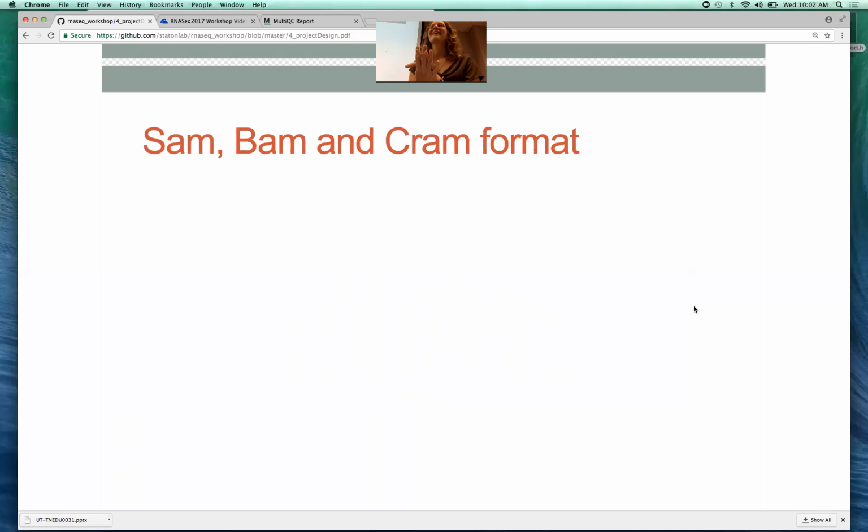So this may be too simple a question, but why so many reads for the same sample? I view it as you've got a sample of RNA and you're going to read it 30 million times. Why do you need so many reads?